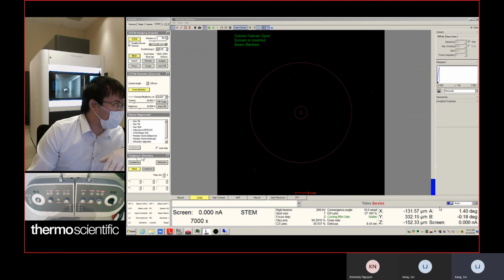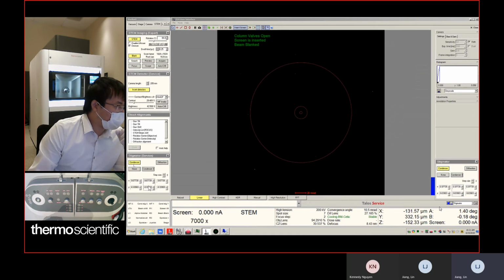The next window is Stigmator. This is the most used tool for getting HR scan imaging. If you select one of them, it gives you a value. You can always right click. It gives you the option to reset to 0, and also you can copy. You see this is 3 columns here. You can copy the column value in column 2 to 1.